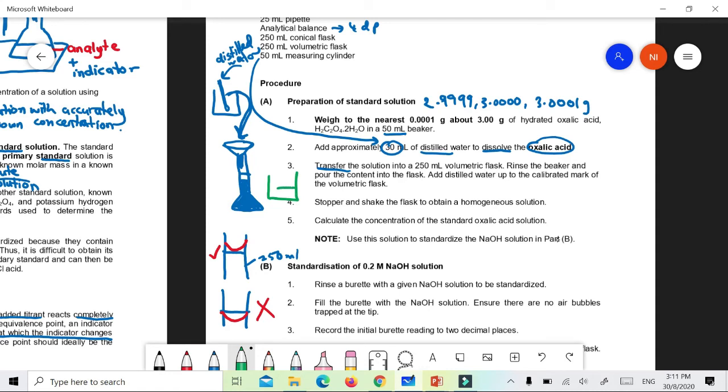beaker yang bersih, okay, isi distilled water, kemudian guna dropper. Remove the funnel, kemudian isi drop by drop. Sampailah dapat seperti ini. Madam, kalau terlebih? Buat balik. Itu sahaja solutionnya. Saya pernah terlebih, lepas tu dia sedut balik, buang.